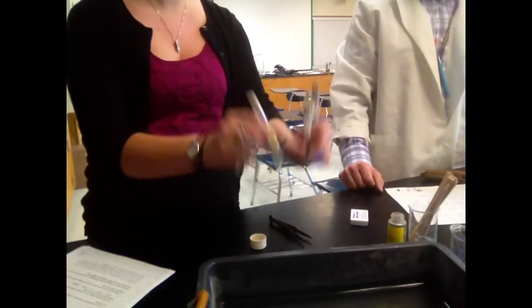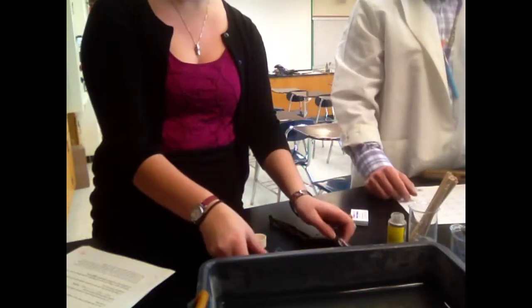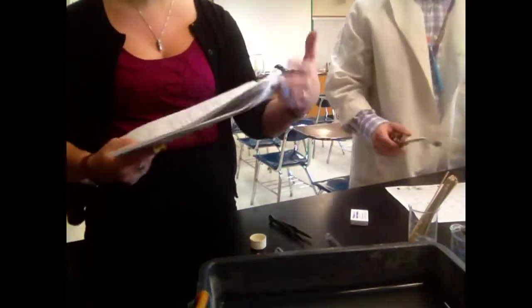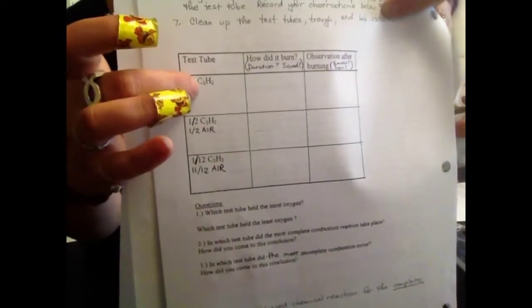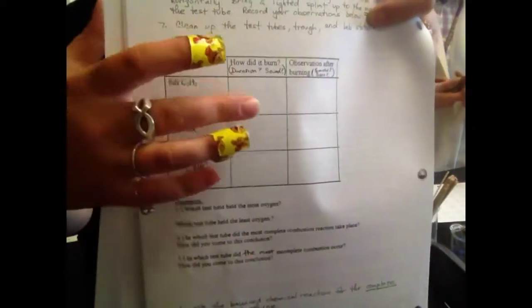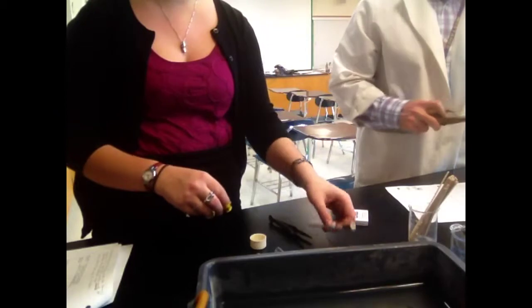Okay. And so now what we're going to do, it's in that order, is take a burning splint and put it next to the test tube. And so on the next page of your lab, there's this data table here. So we're going to start with this full C2H2. That's the same thing as acetylene, C2H2. This full test tube, put a lit splint next to it and see how it burns and if we end up seeing any soot forming to tell us that there's an incomplete combustion. If no soot forms, then we have a complete combustion.